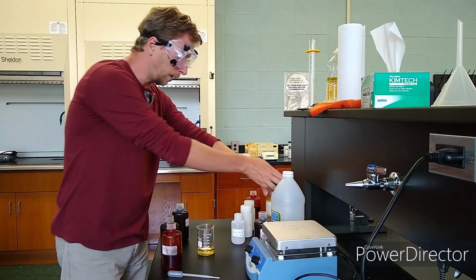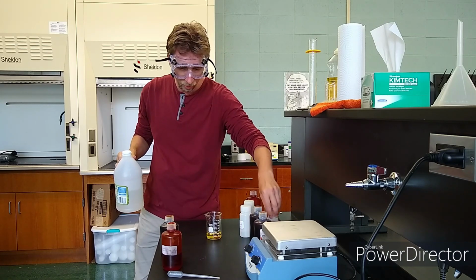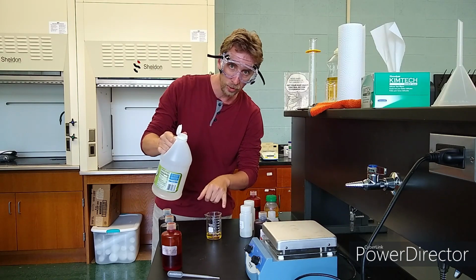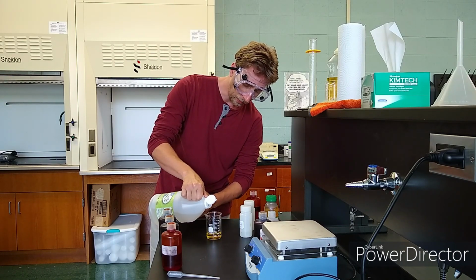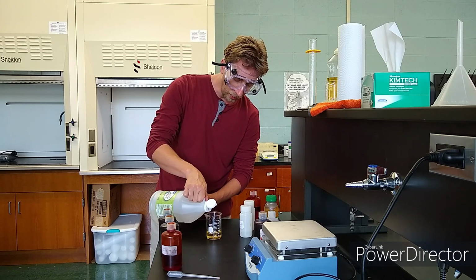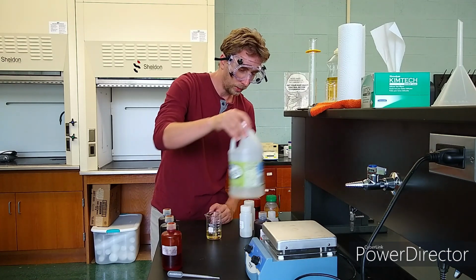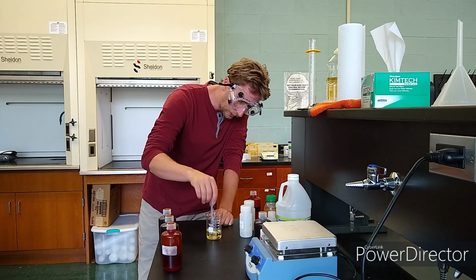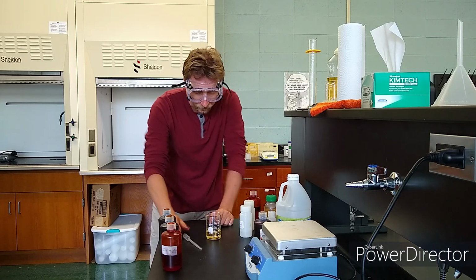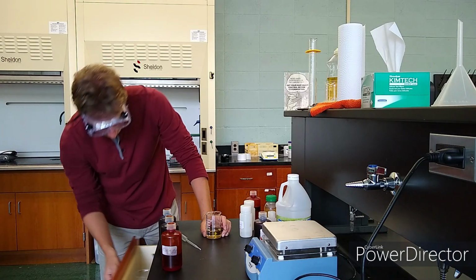So I got the juice, and now in the regular lab procedure, you are going to add some vinegar to the juice. This is supposed to preserve the vitamin C, the ascorbic acid that's in there, so that it doesn't react or degrade while you're trying to measure it. You want it to be in top form and every bit of it to be present. Now, I got a total of a little less than 50 milliliters.